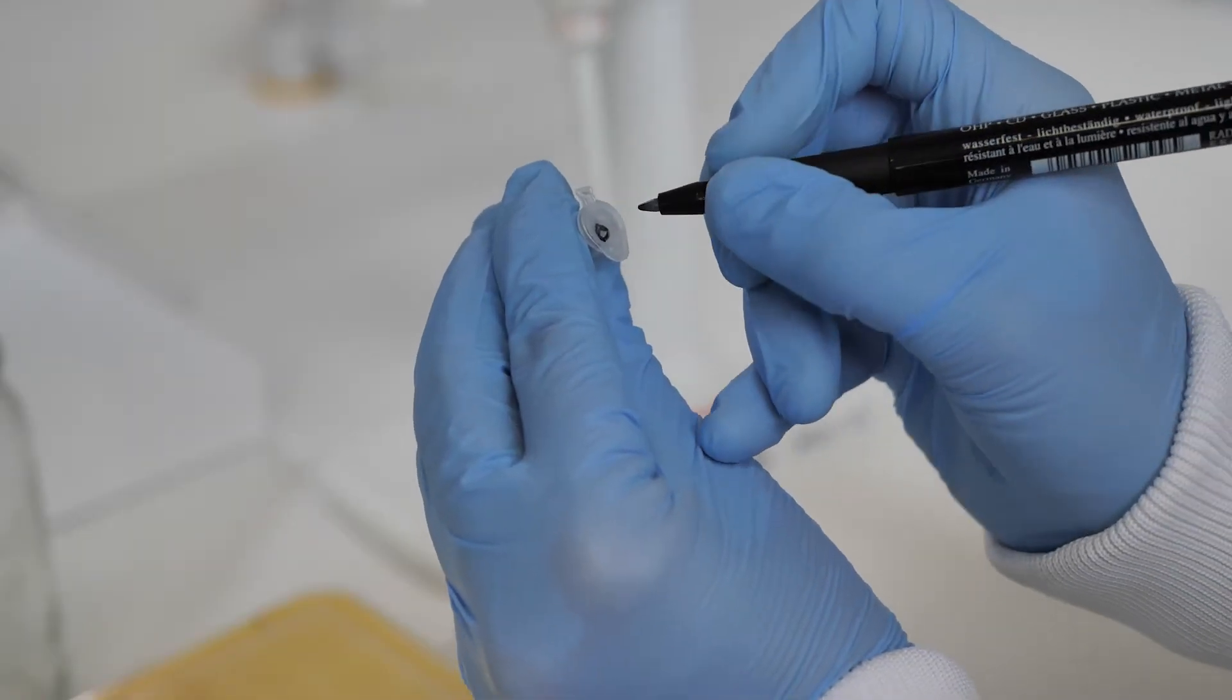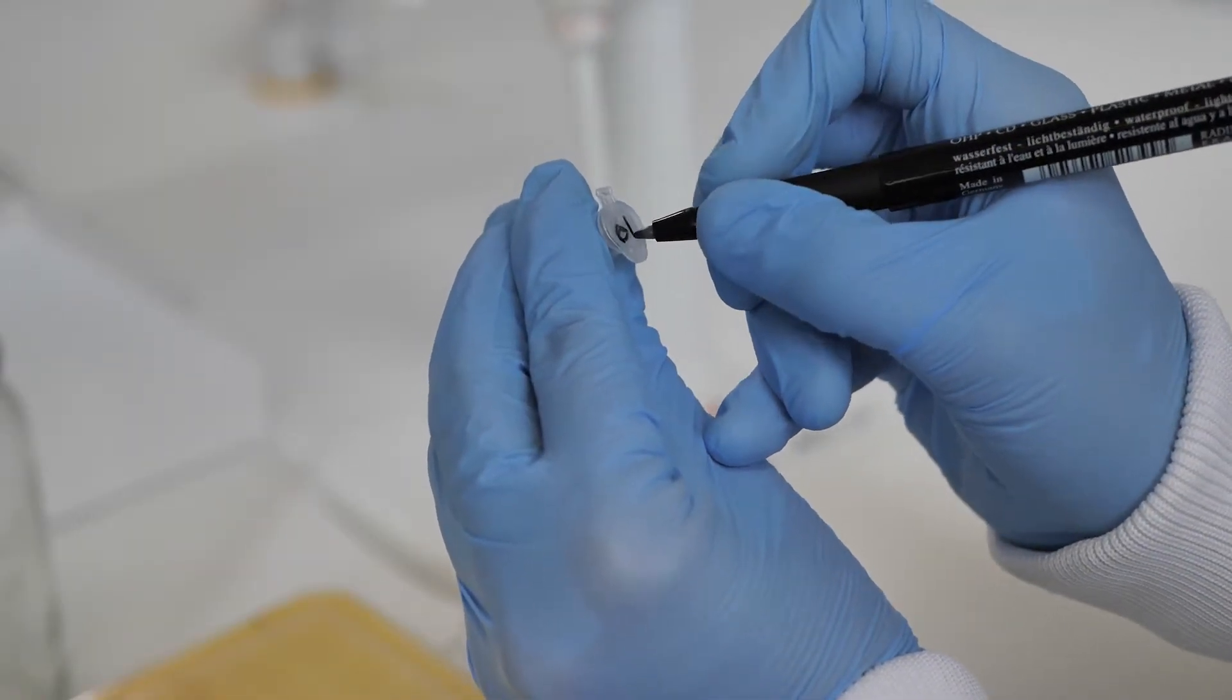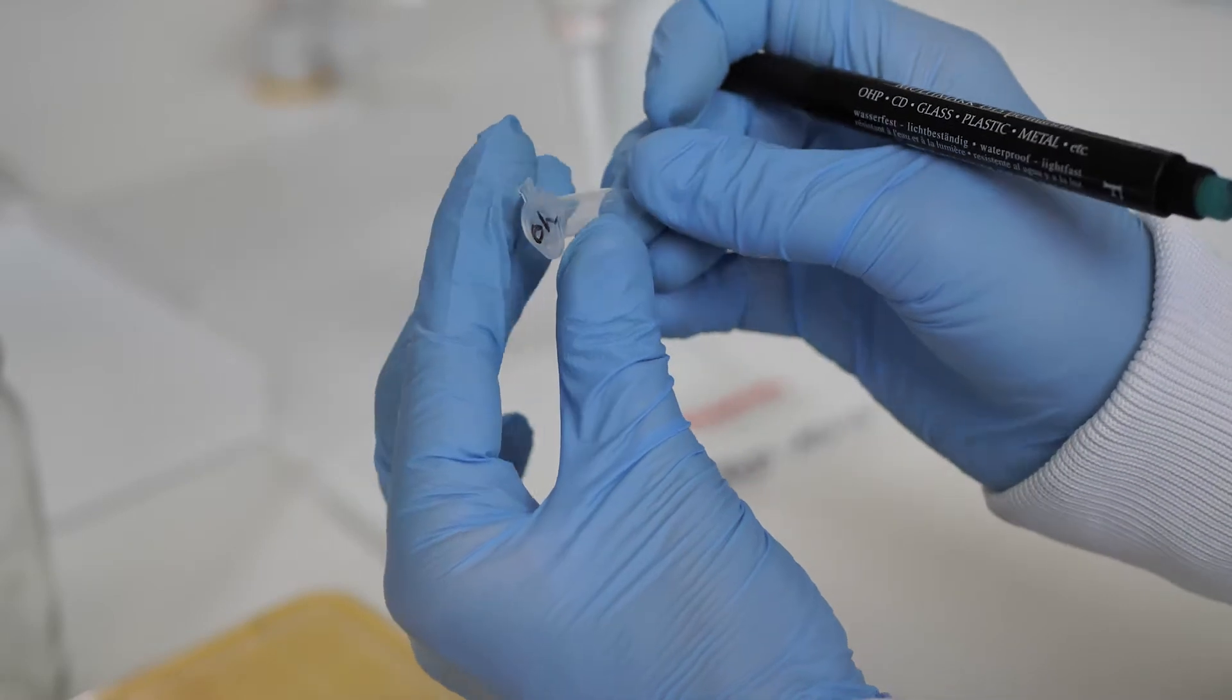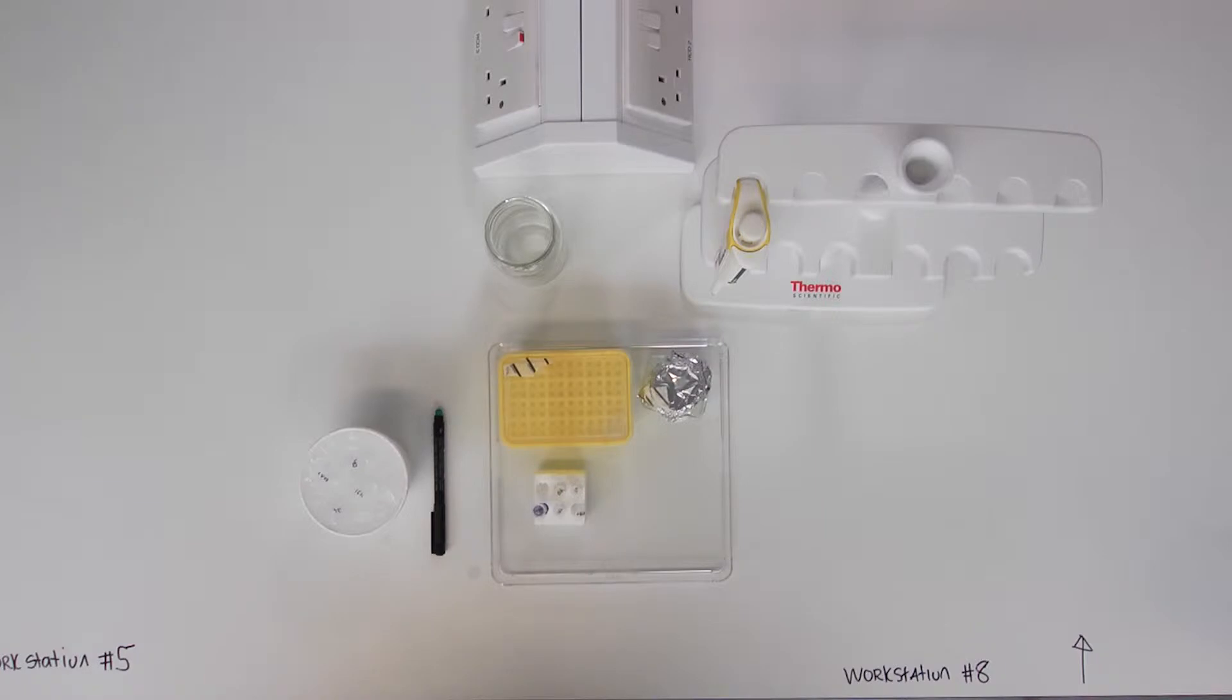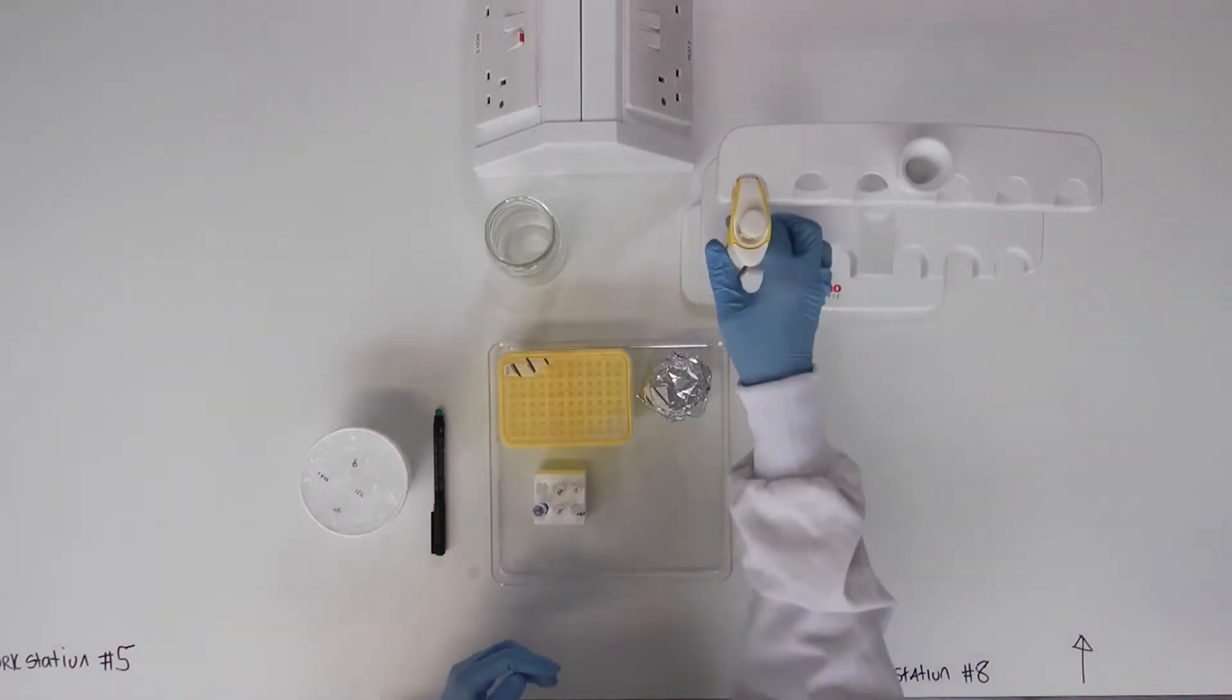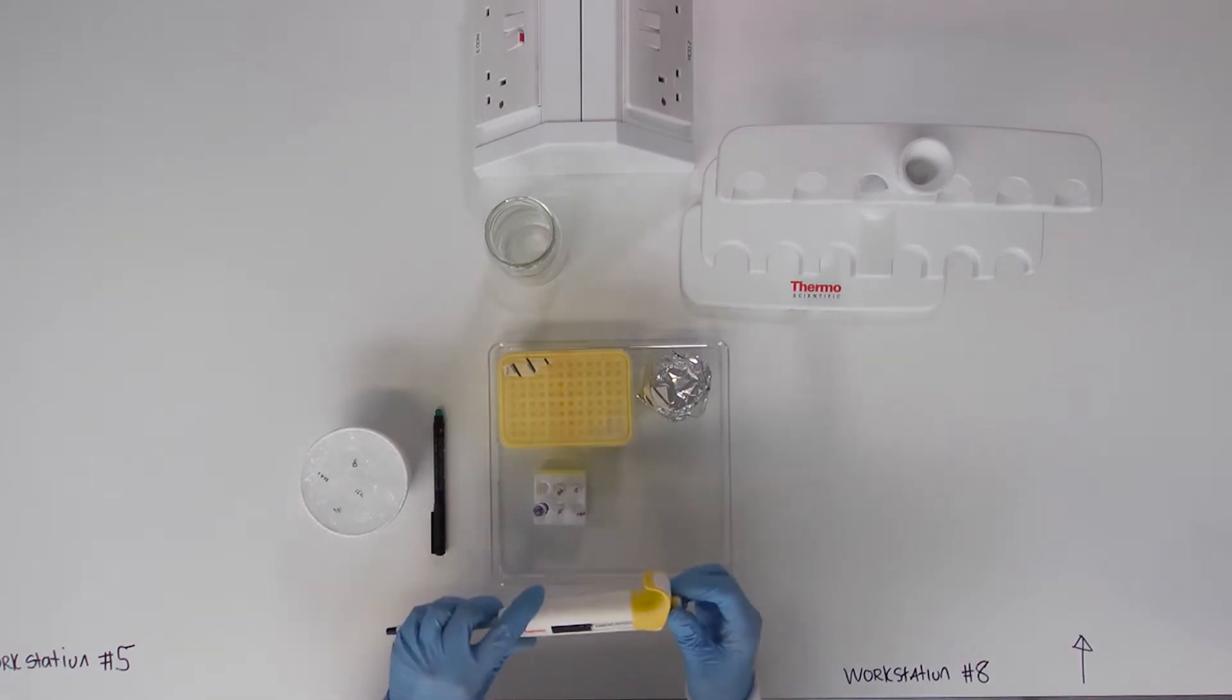Label fresh tubes for each time point and the standard and include a group identifier or initials. Pipette an equal volume of the cell solution and reducing buffer into each respective tube.